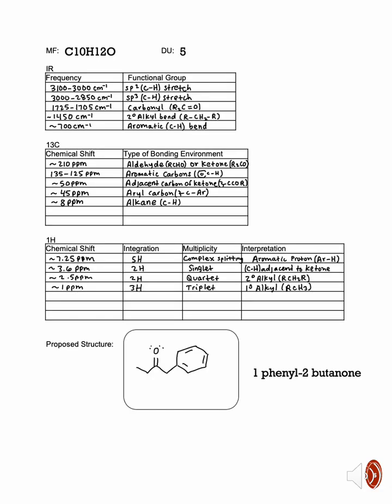Overall, in summary, the molecular formula given contains some degree of unsaturation along with an alcohol, ketone, or aldehyde. The IR spectroscopy eliminated the possibility of an alcohol, but it did confirm the presence of a carbonyl and aromatic group. The C13 NMR eliminated the possibility of an aldehyde since the typical signal was not present. The question left was, where would the ketone lie?